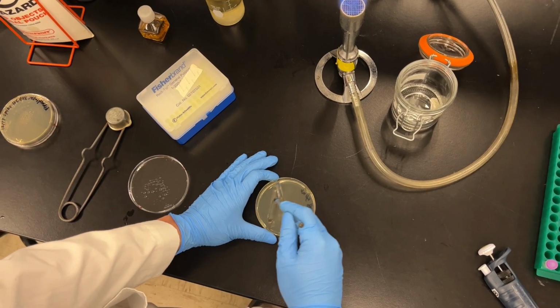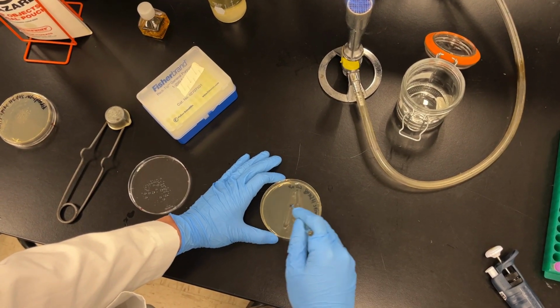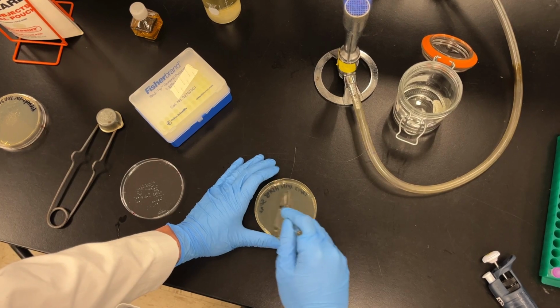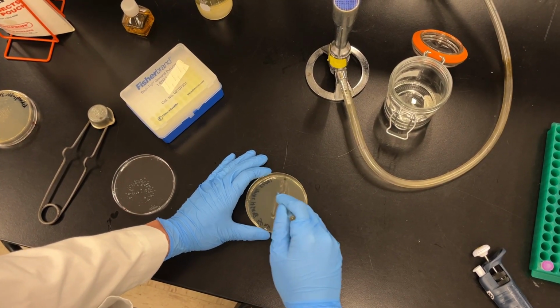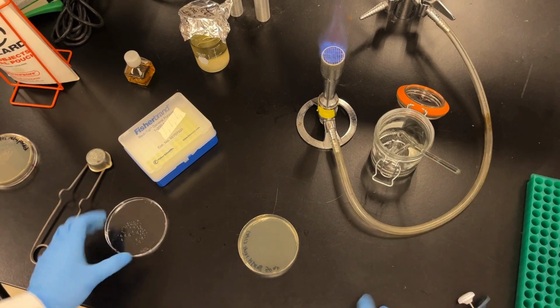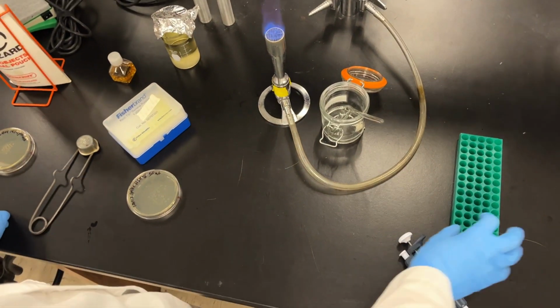Jaden is going the same way. I like to spread in a clockwise direction and turn the plate in a counterclockwise direction, and slightly larger circles than what Jaden is doing here, but at the end of the day, this should work just fine. Keep on spreading until you feel a little bit of resistance as the liquid starts to get soaked up in there. It'll take about 30 seconds or so. Once that's done, put the spreader away, close the lid, and we're good.